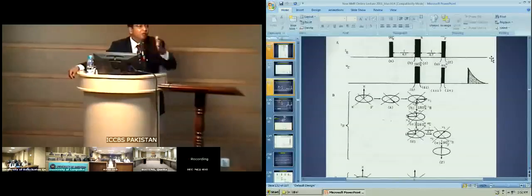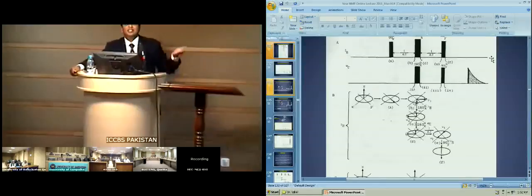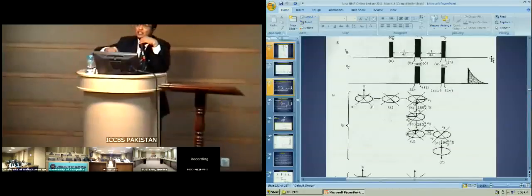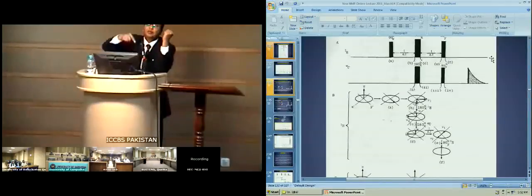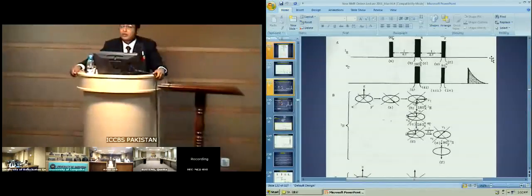But if we just add before it an INEPT, in which you have a regular polarization transfer, and then you take enhanced signals of carbon and transfer it to the proton again. Wonderful thing. So you sometimes do it 6, 7, 8 times. INADEQUATE is now polarization transfer from carbon to proton, proton to carbon, and then carbon to proton again, and then you see proton detected INADEQUATE experiments.